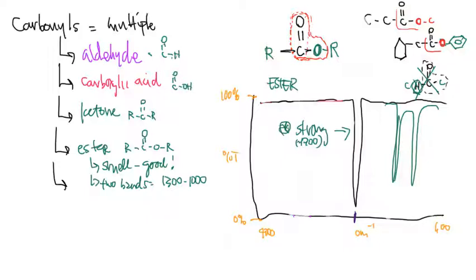I would see two major peaks that show up on that side. However, they don't have to be as intense as I drew them. They do not have to be the same intensity. One can be a little bit shorter, the other one can be a little bit longer. It doesn't matter. There's no rhyme or reason. And again, this is why I don't like to classify esters and have you pick out just an ester and that's it.